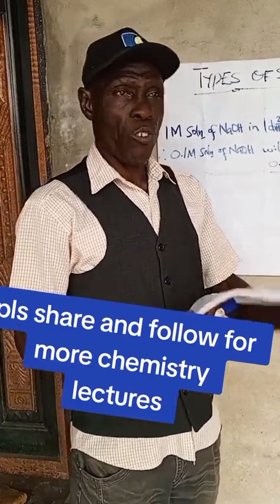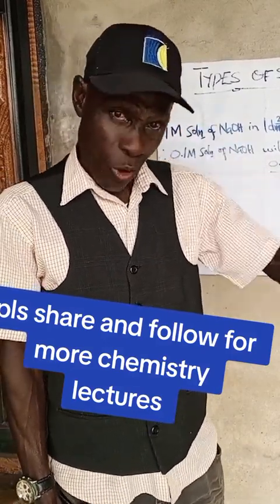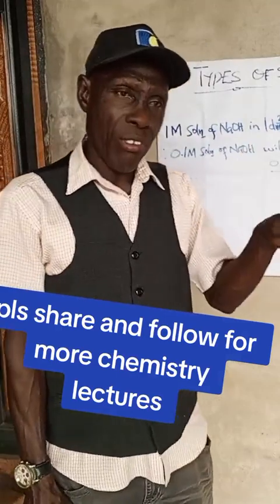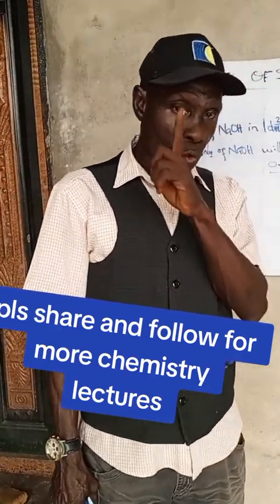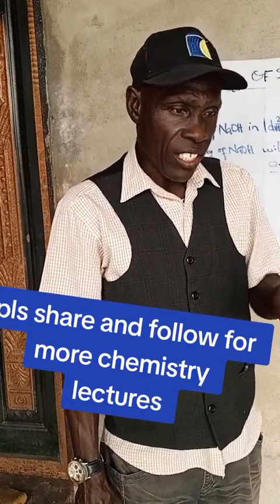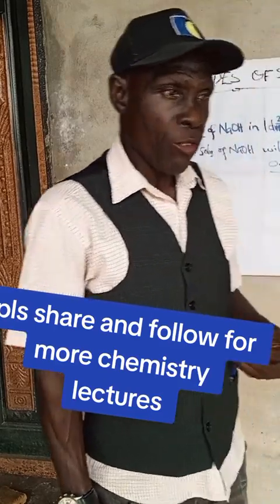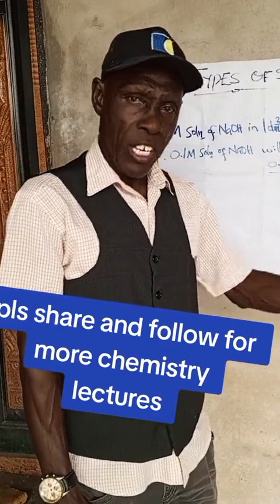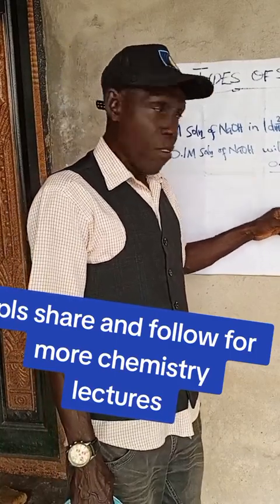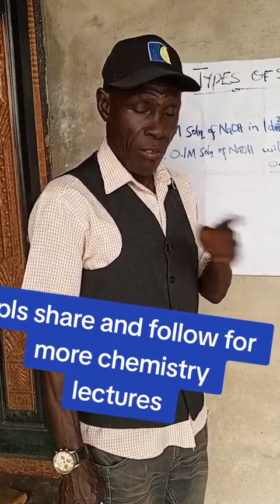So no matter what it is, you must first of all remember the molecular mass of all the elements in that compound. Then know this formula: that when that amount dissolves in 1 liter of water, you have gotten 1 molar solution. So you convert the statement that 1 molar solution contains this amount of chemical substance, so that if you are looking for 0.5 molar solution or 0.7 molar solution, you are able to calculate and know the number of grams of that substance you need before you dissolve it in 1000 cm cube of water.